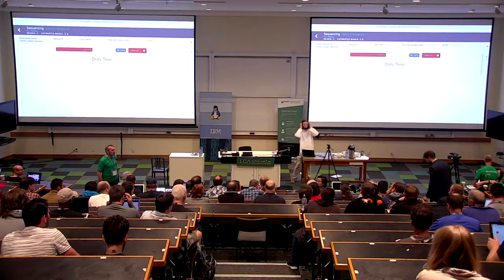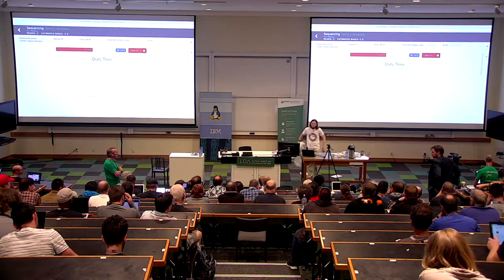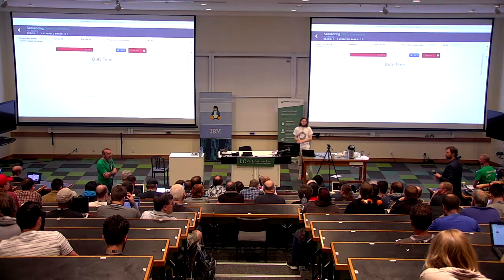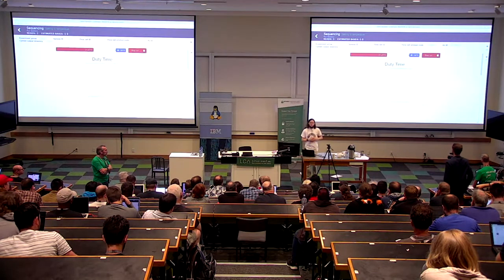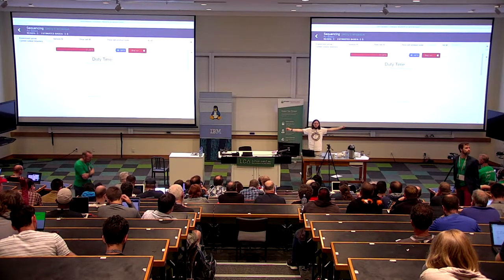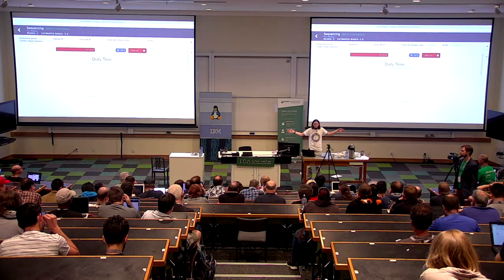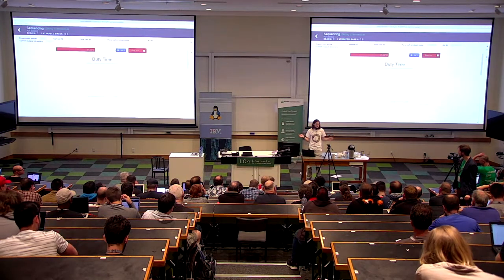What are the error rates like? Okay, the error rates, the DNA sequencer produces about 5 to 10% error. So that's not particularly good, but this particular sequencer has really, really long sequences, and the error rates are effectively random. And so you can sort of work around the error, even though it is quite high.